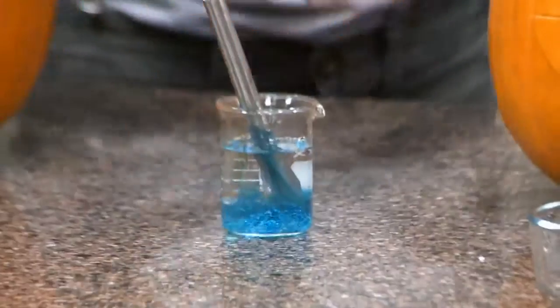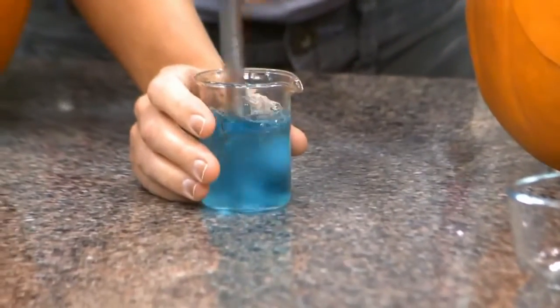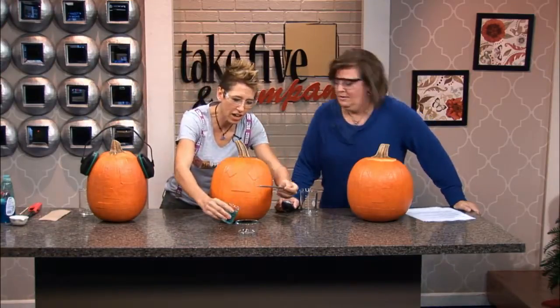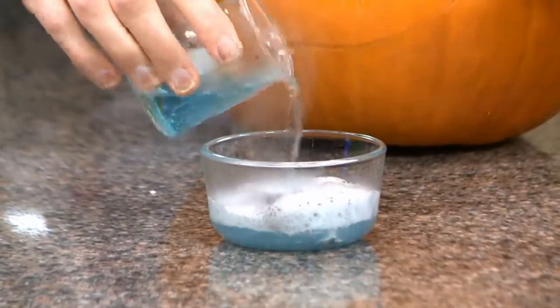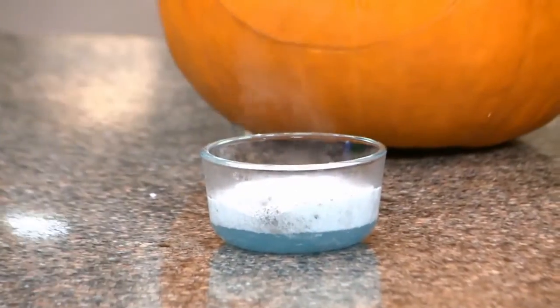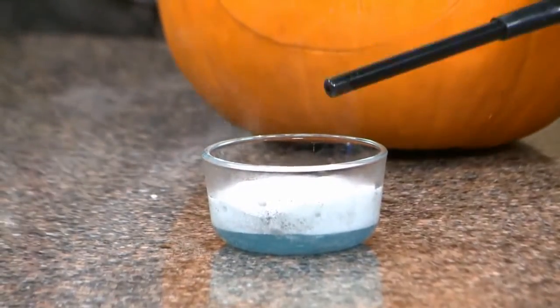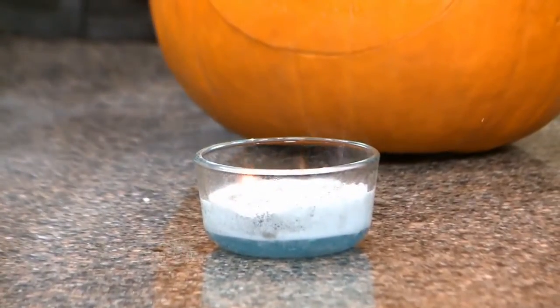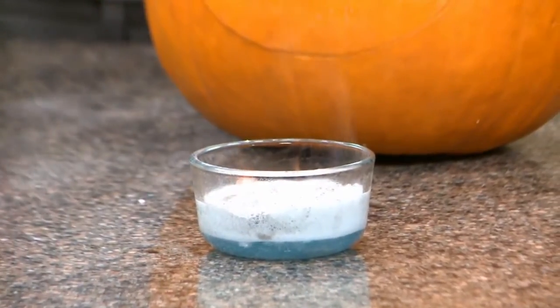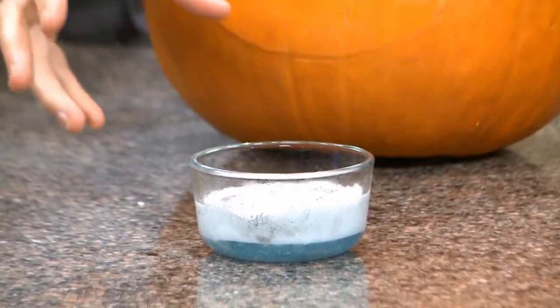I'm going to add bubble solution because when I produce gases I like to trap them — gases just want to escape, so let's hold on to them. I'm going to trap them in this bubble solution. And you're going to see when I add water, this does produce a gas. That gas is acetylene gas. See how that acetylene gas — it's like I'm burning bubbles — that is acetylene gas getting produced when calcium carbide reacts with water.